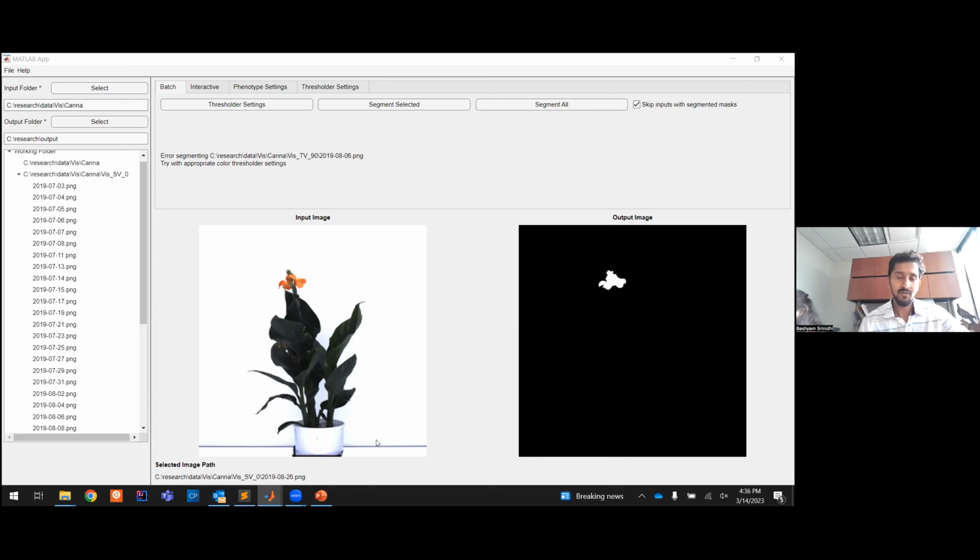Usually, for any picture that is taken, there would be an object next to it, like a coin, or any other object, like a scale itself in the image. If that is the case, if we can get cues of the scale in that image, then it's possible to convert it. Else it depends on what the user thinks the scale is, if we don't have the cue. I hope that answers that question.